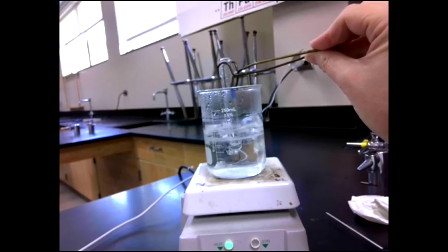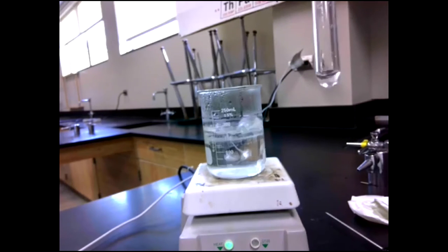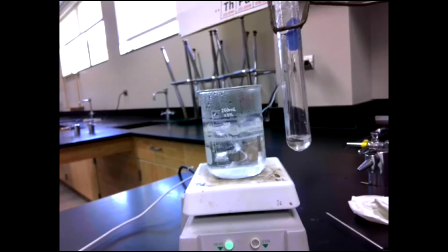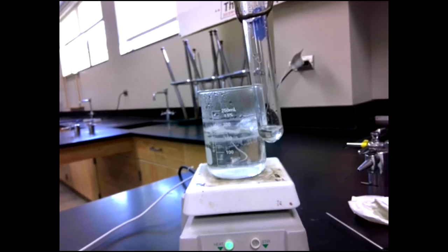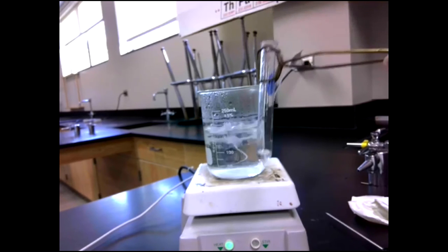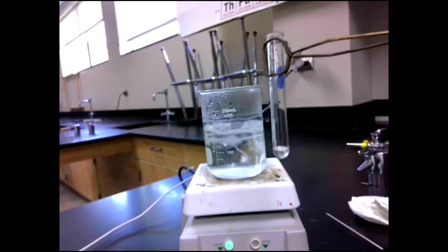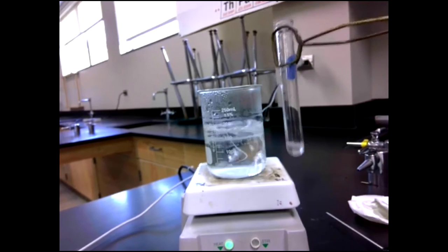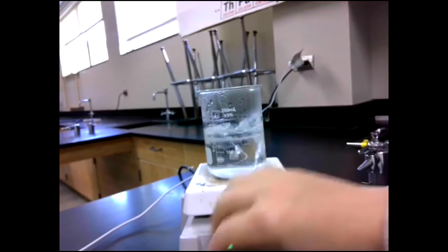Yeah, so it didn't even take a minute. Totally liquefied, completely melted. And again, we don't know its actual melting temperature, but we know that it melts lower than 100. And in the world of chemistry, that's low melting. So we just say that it melts at a low temperature, or it has a low melting point. I'm done with that.